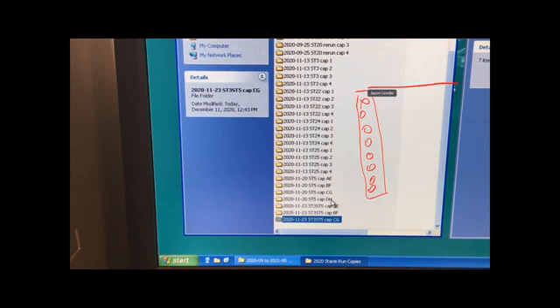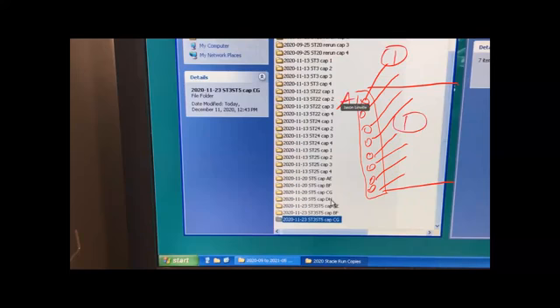And then it goes across here. The 4 capillaries go into A, B, C, D for one injection, and then they come back and go into E, F, G, H. So capillary number 1 that goes into A also goes into E. The capillary that goes into B also goes into F.